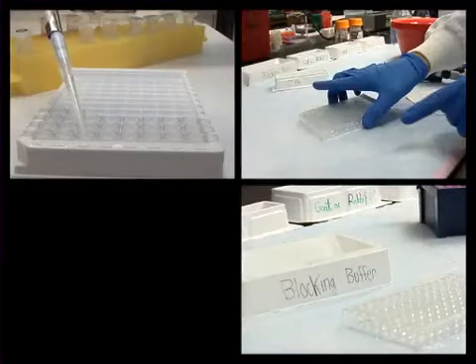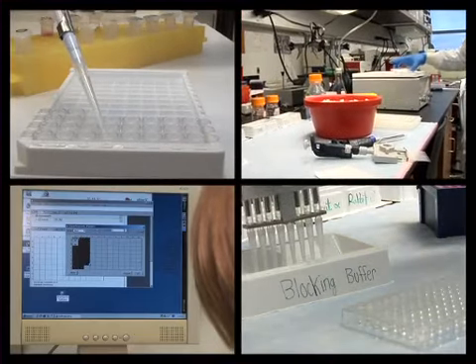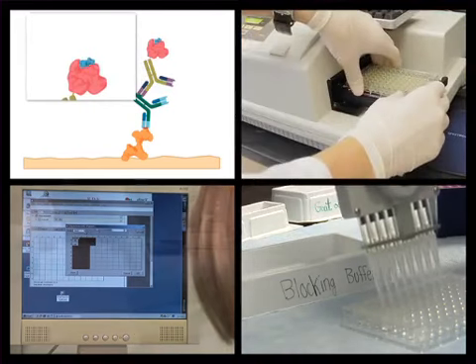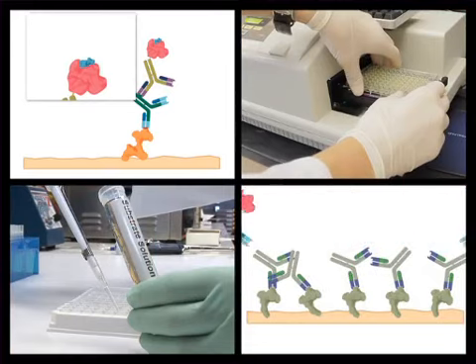You've just watched JoVE's introduction to performing an ELISA. In this video, we reviewed what an ELISA is and how it works, what equipment and reagents you'll need to perform an ELISA, and some different applications of the assay.